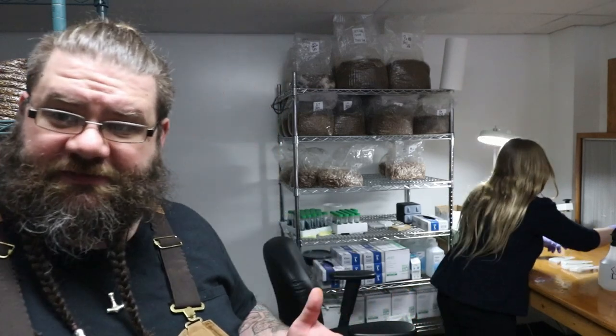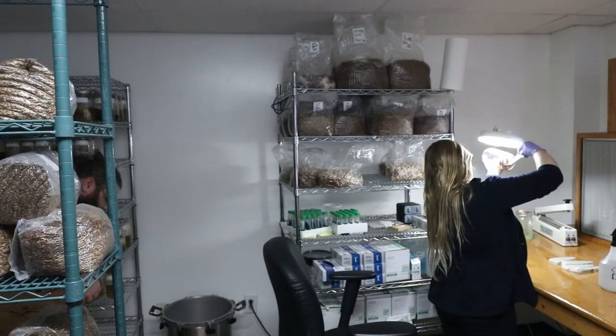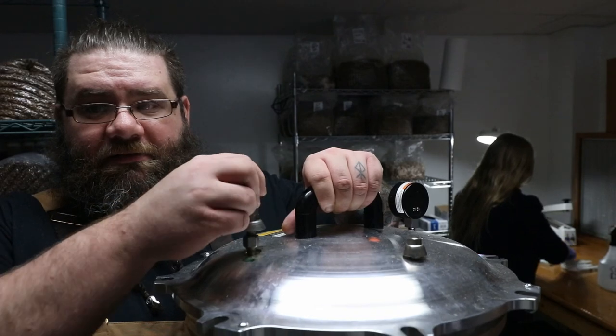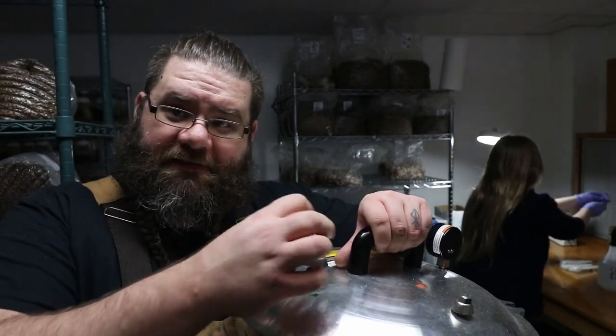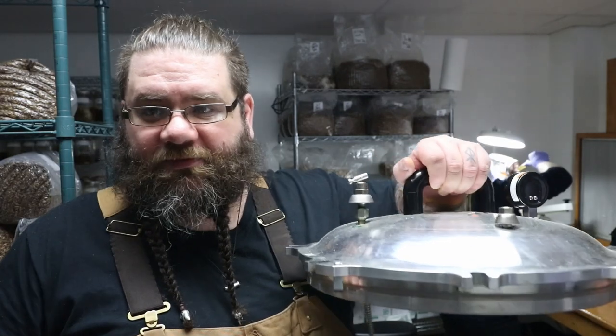That's pretty much it on the sterilizers. The big difference between a pressure canner and the sterilizer is really this little stopcock right here. That holds pressure, whereas the rocker that it sits on and rocks bleeds off pressure. It never seals completely. What you're doing is continually adding heat so that it's always got pressure being added to it. So really, this is the difference between the canner and the sterilizer.